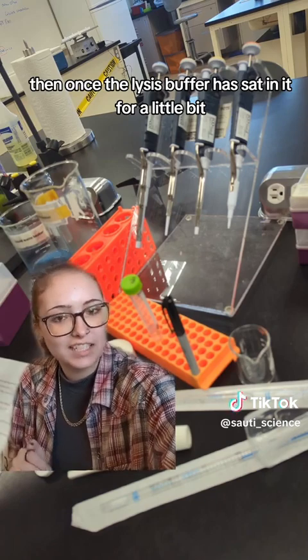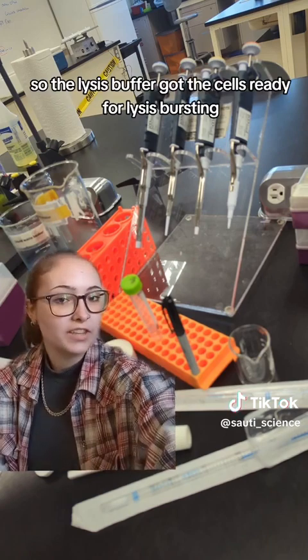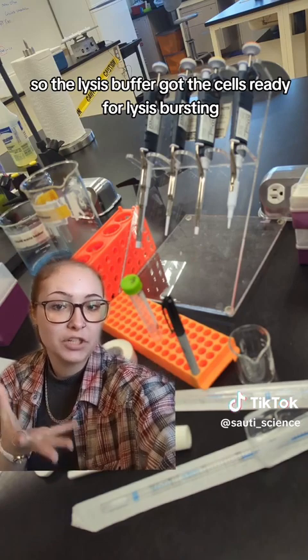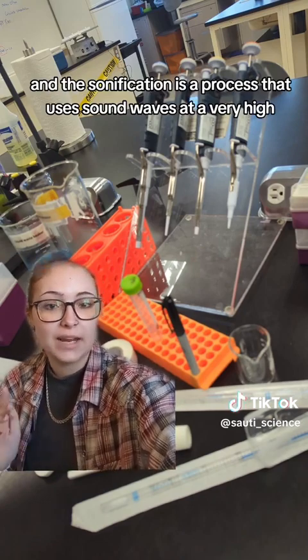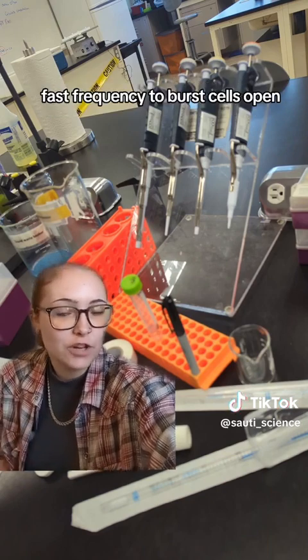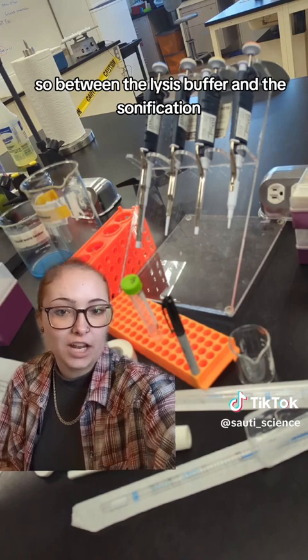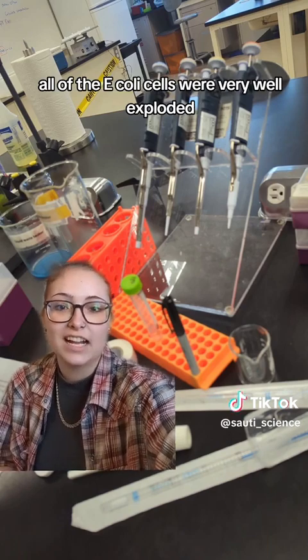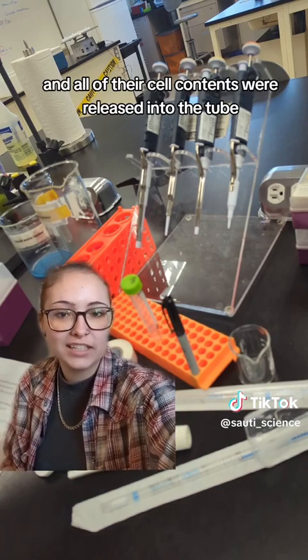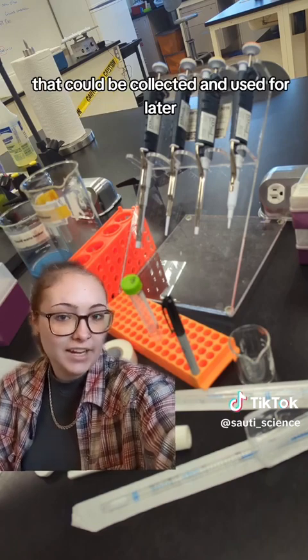Then, once the lysis buffer had sat in it for a little bit, we did a process called sonification. The lysis buffer got the cells ready for lysis bursting, and sonification is a process that uses sound waves at a very high, fast frequency to burst cells open. Between the lysis buffer and the sonification, all of the E. coli cells were very well exploded, and all of their cell contents were released into the tube to be collected.